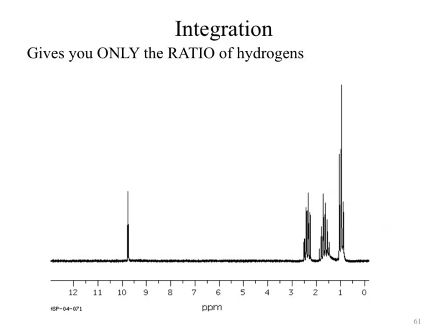No, just kidding. I think that's a bit nonsense because you should actually have some more data, because in the real world you have more data. When you run the spectrum, you have a computer and you can tell the computer, tell me what the area underneath this curve is. And it'll spit out a number that's probably something ludicrously weird, 2,362.89.